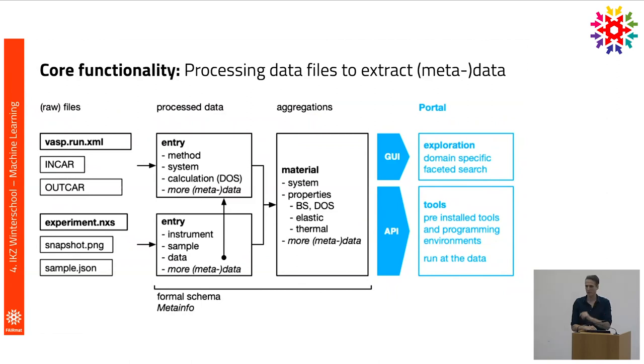The same method might be applied to data that is coming from an instrument. For example, there might be a Nexus file that is coming out of some kind of microscope. There would also be a parser that interprets the Nexus file and reads all the information about the instrument used, the sample used, and so on and so forth.